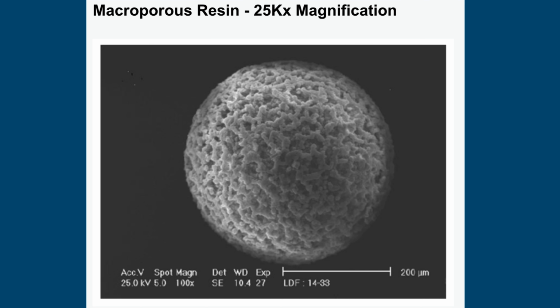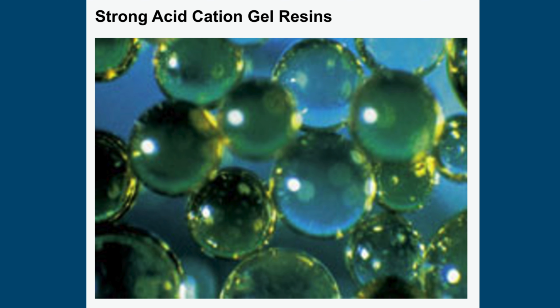Porosity and swelling. Following polymerization, the initially hydrophobic PS-DVB matrix has little water uptake. Functionalization introduces ionic groups that strongly hydrate. The resulting osmotic and hydration forces cause the polymer network to swell until balanced by the elastic restoring forces of the cross-linked network. Thus, resin performance reflects a compromise between mechanical strength and swelling and pore accessibility and ion diffusion and exchange capacity.